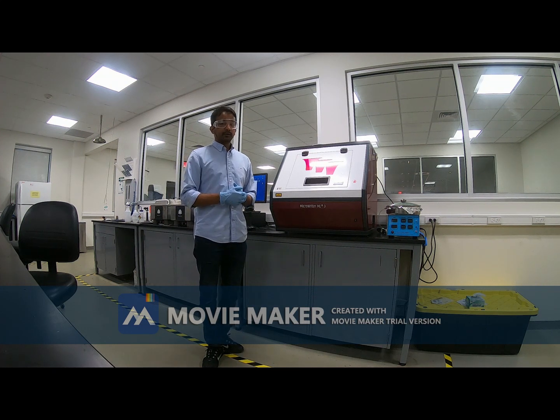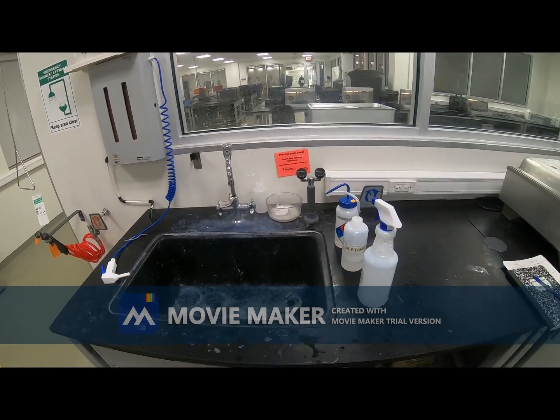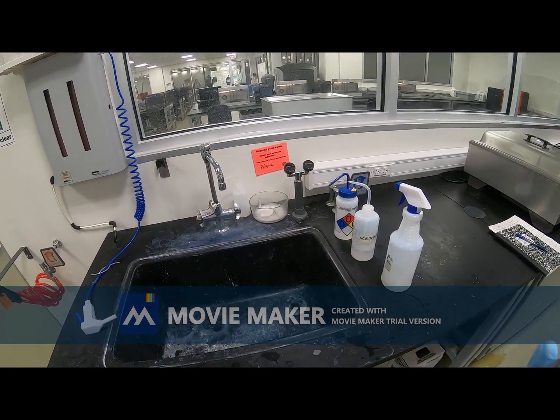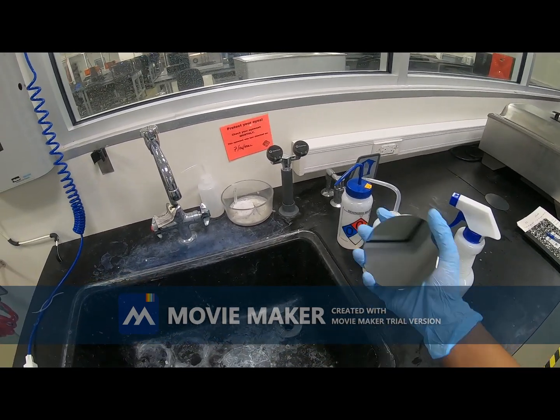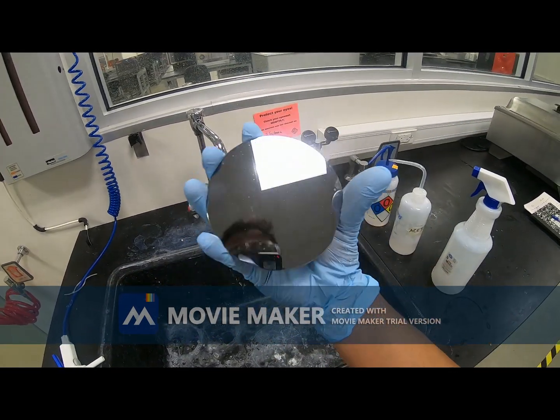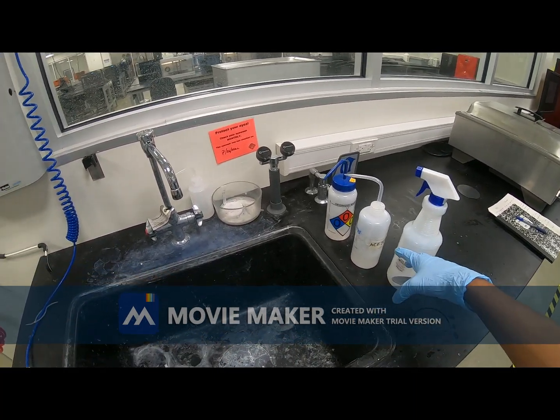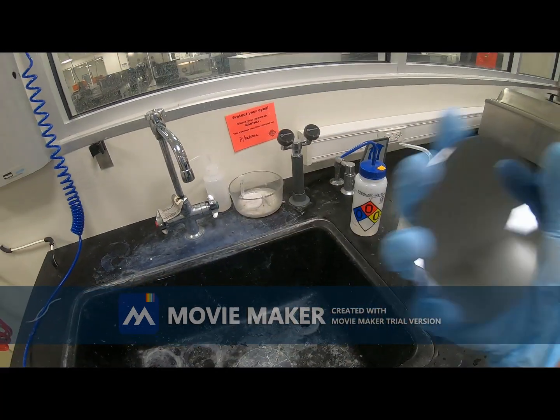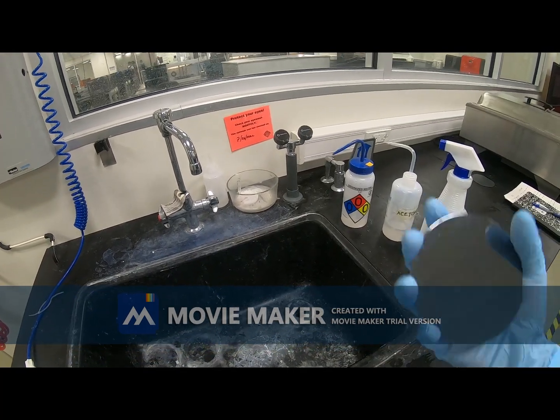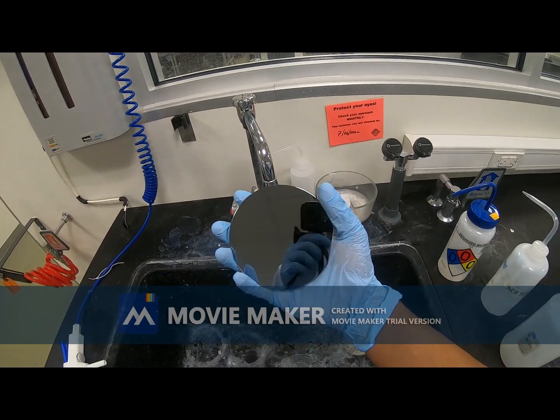Now let me start the photolithography, and I will start with the cleaning of the silicon wafer. Actually, I already cleaned the silicon wafer. This is my silicon wafer. What I did, I used acetone at first to clean the dirt from this silicon wafer. Then I used IPA, or isopropyl alcohol. Then I used deionized water, or DI water, to remove the acetone and IPA from the surface of this silicon wafer.